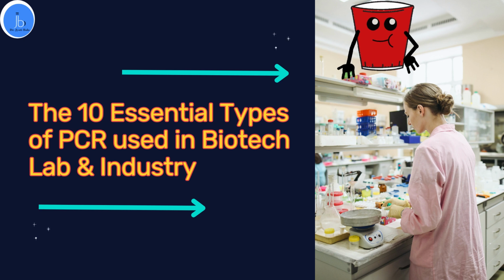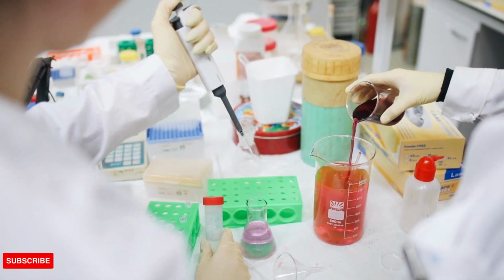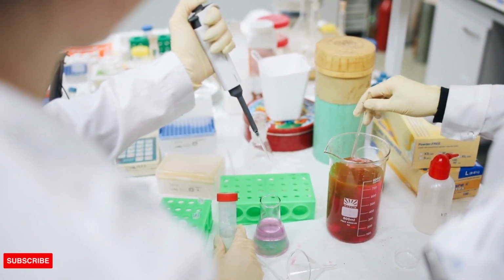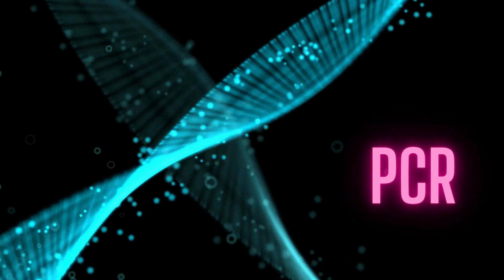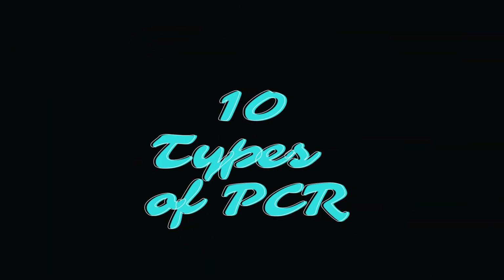In this session, we are discussing the 10 most common types of PCR technique which are used in biotech lab and biotech industry. So let's start the session. As you know, PCR is a very important technique which we utilize in the biotech sector. So if you are in a biotech laboratory in the R&D sector, you need to amplify DNA for your various projects, and for that purpose we need polymerase chain reaction. So here we are exploring 10 of the essential types of PCR which are quite common in the biotech lab.